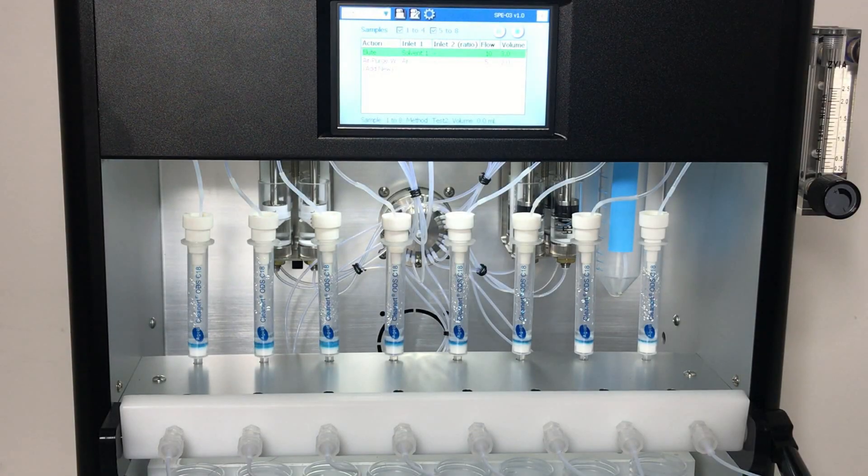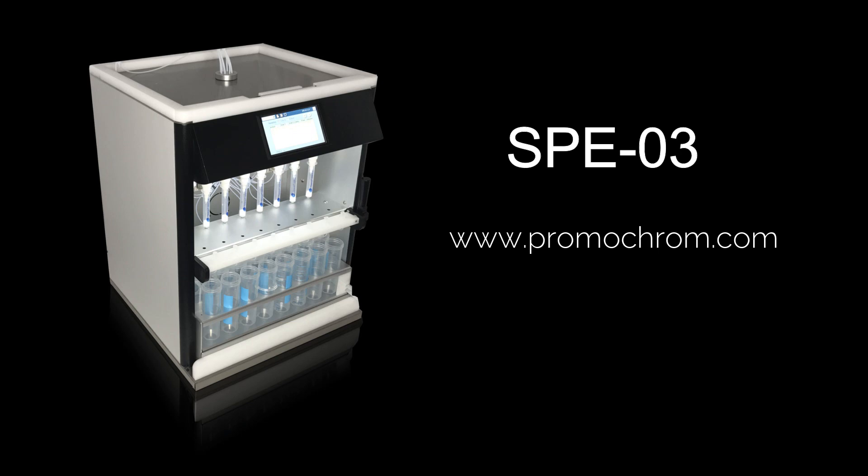With its wide range of capabilities, the SPE03 can also be used in many other applications. To learn more about its features and specifications, visit our website at www.promachrom.com.